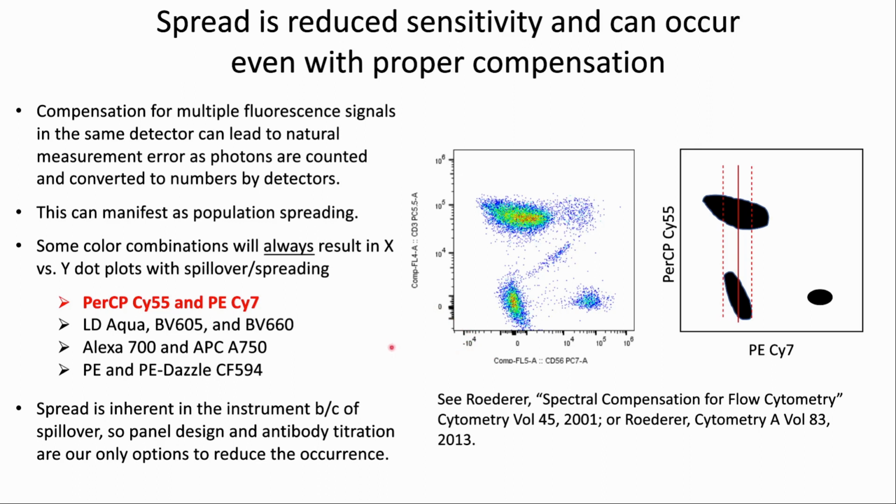So, therefore, to avoid this, we would suggest not to, as an example, choose CD3 in PE-Cy7 and CD4 in PerCP-Cy5.5 because those two markers will be co-expressed on the same cell, and when plotting these out, a user would encounter this kind of trumpet spread.